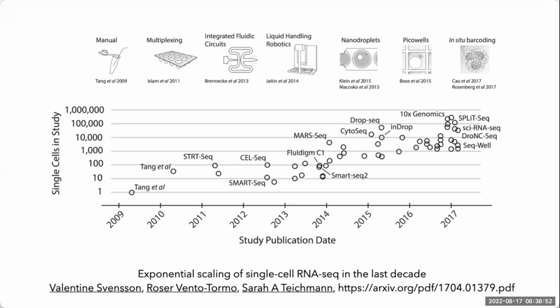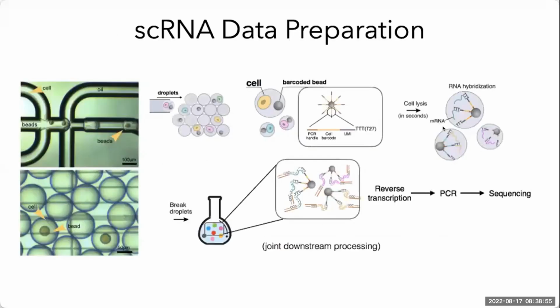So when we talk about data preparation, single cell RNA transcriptomics differs from bulk RNA transcriptomics, and a major part of that difference comes in the preparation of data. So how can you effectively separate the cells for sequencing? There are methods that can be categorized in different ways, but two of the most important aspects are the approaches to quantification and the approaches to capturing and isolating single cells from the tissues.